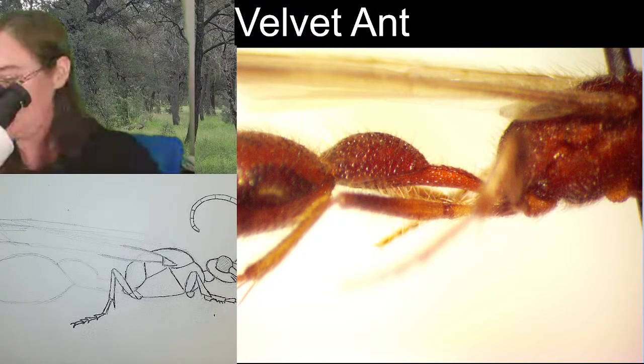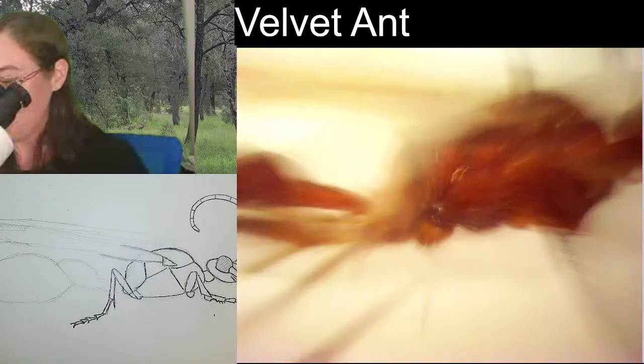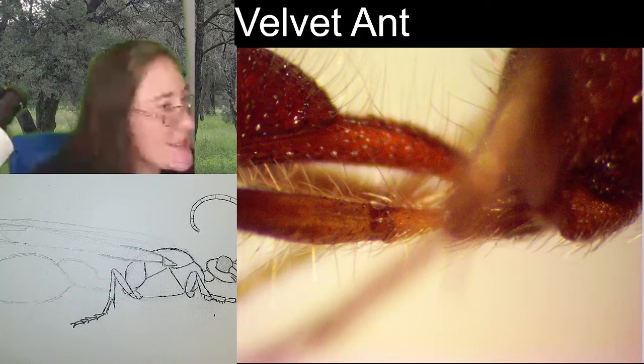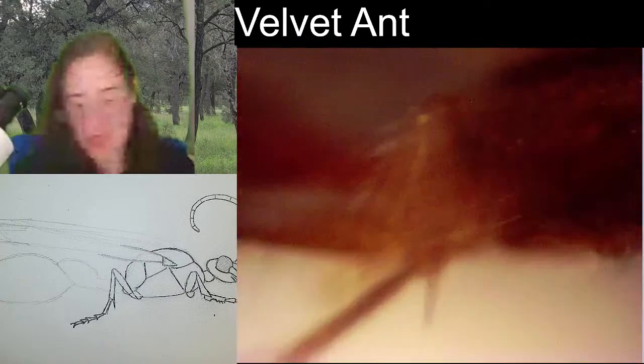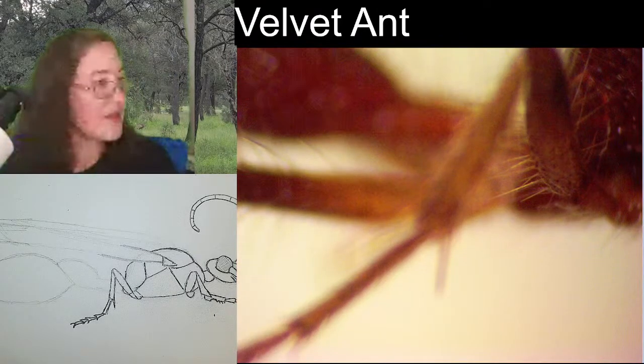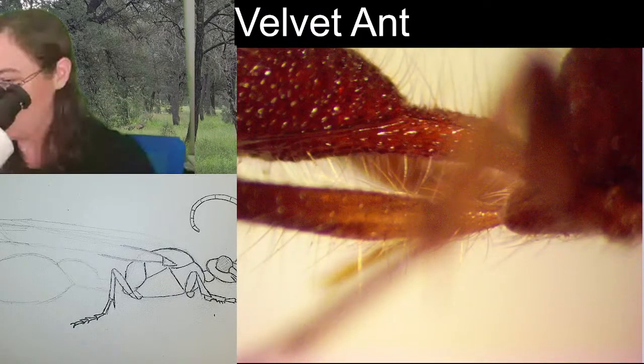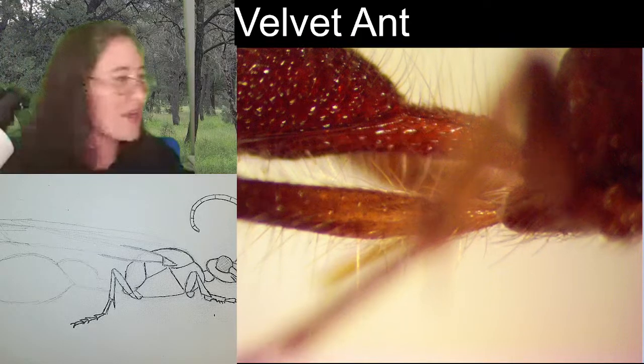There's this conical segment, and I hope that you might be able to see it. I want you to see it. It's gonna be tricky. It's weird how some things are very obvious in my microscope, and then they don't really translate to the camera as well.